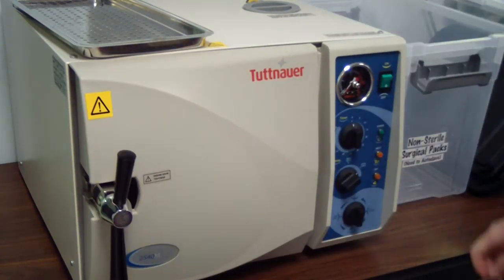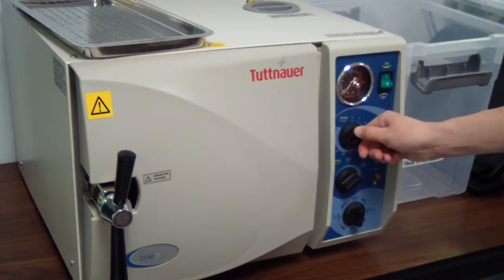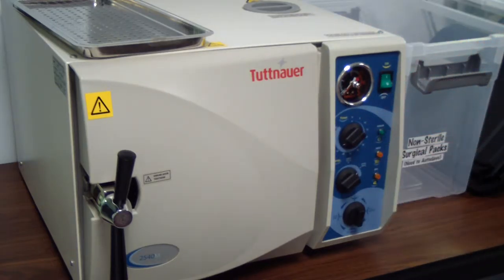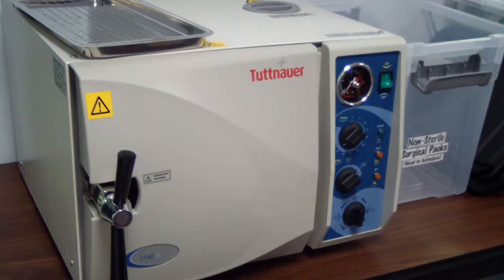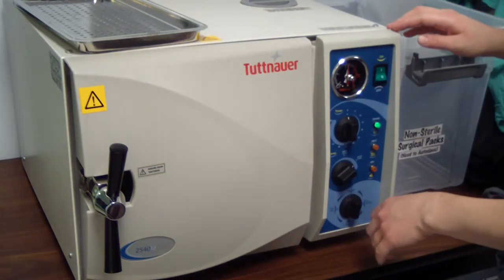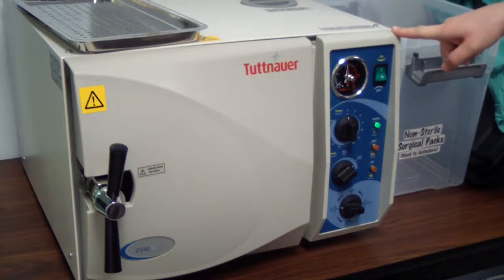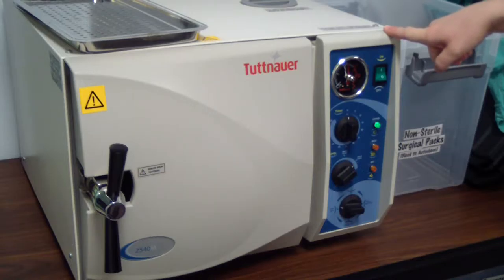You're going to turn on the autoclave and set the timer to turn on. Once it dings, you need to turn to exhaust dry and watch the weight line go out to zero.